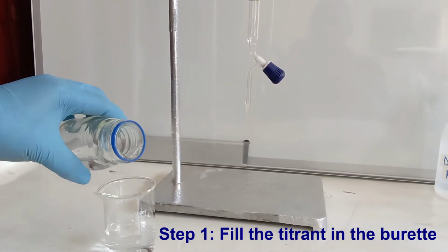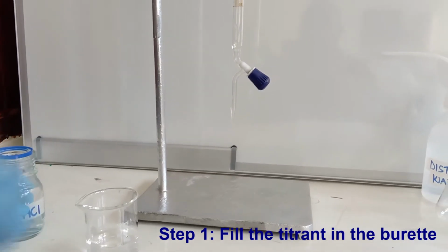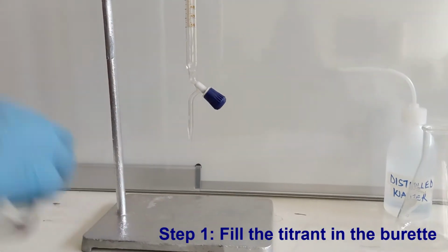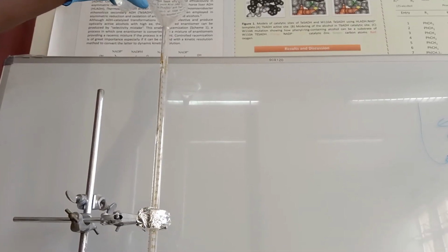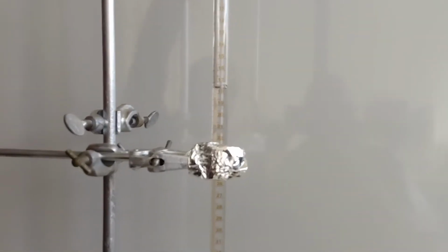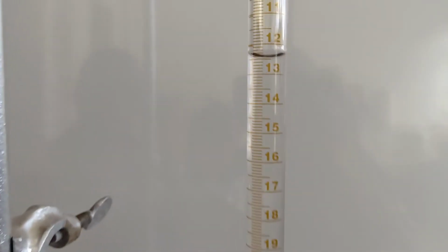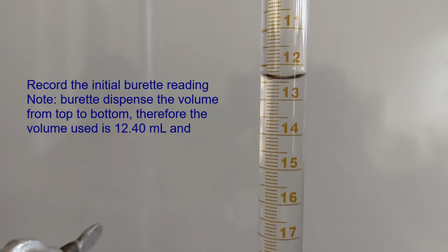Make sure the burette tap is tight, and then fill the titrant in the burette. Fill the burette not necessarily to 0, allow the titrant on the wall to settle, and record the initial burette reading.